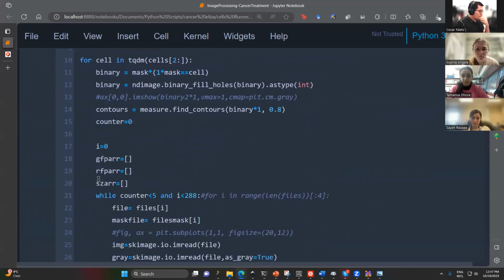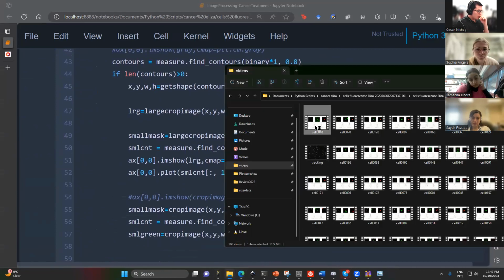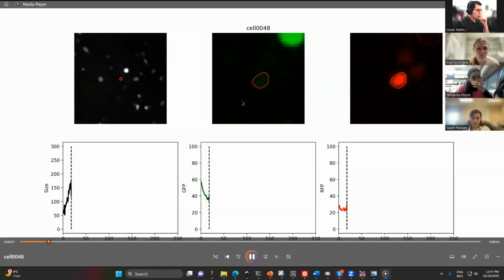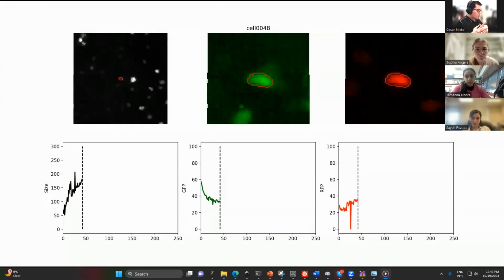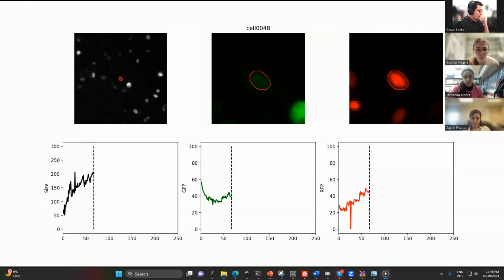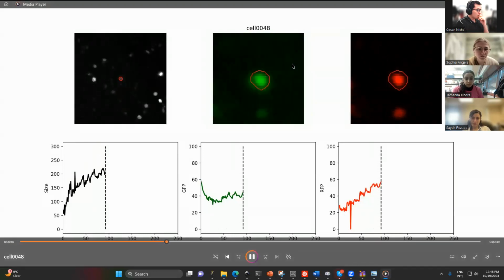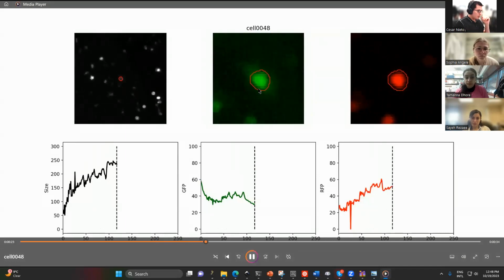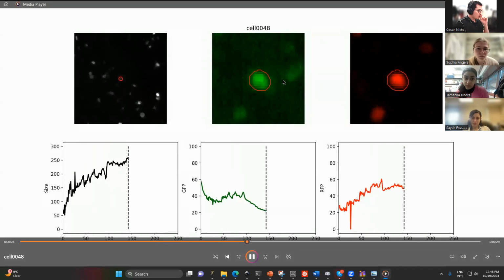And this last one corresponds to the script for obtaining this particular tracking for all the cells, so that you can verify more or less if this cell size makes sense or the tracking is correct, how bad or how good it is. I'm not an expert on this kind of dimensions, so I'm not sure if this tracking was fine or wrong. So you guys know more.